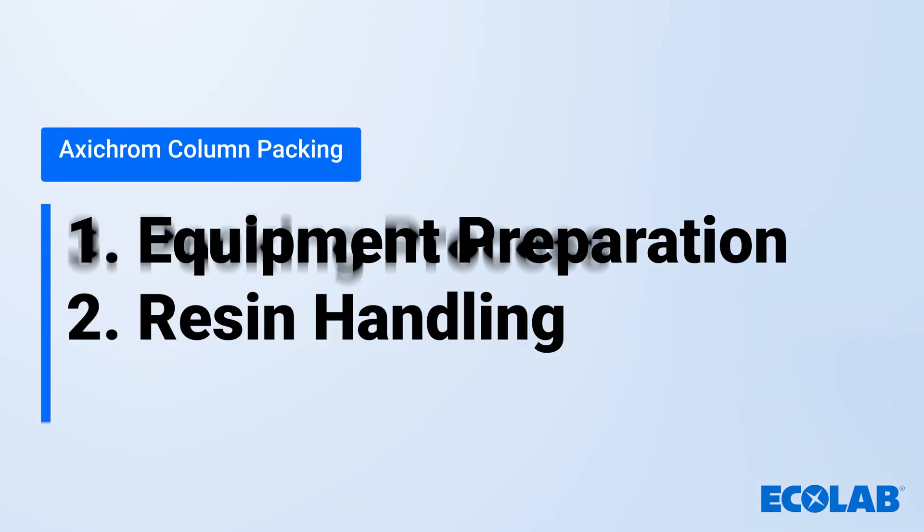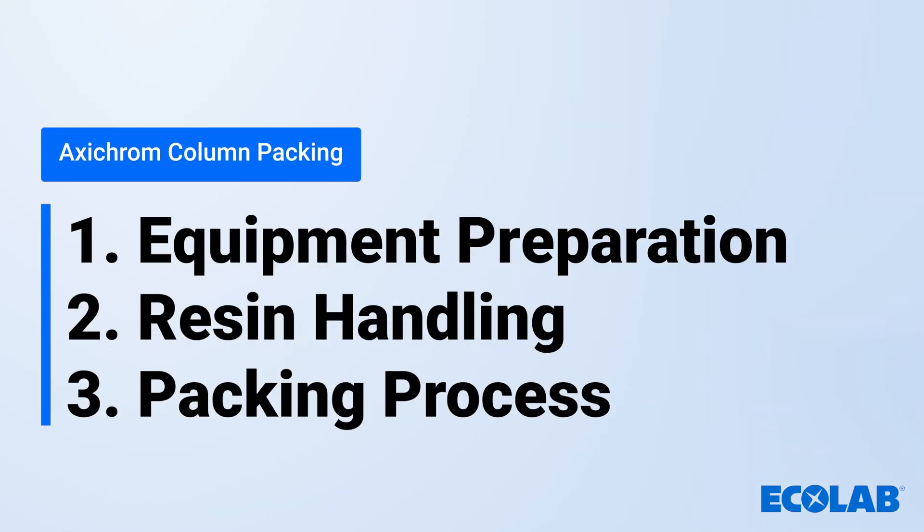We'll cover everything from equipment preparation and resin handling to the actual packing process. Whether you're new to column packing or looking to refine your technique, this video will provide valuable insights to help you achieve consistent and high-quality results.